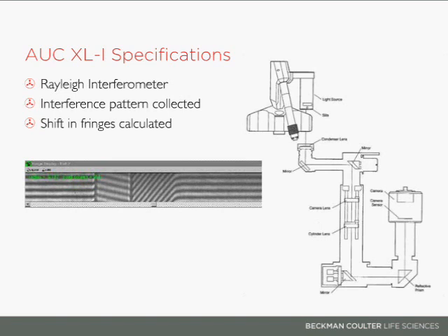This method works well for nanoparticles that don't absorb light in the visible region, some liposomes perhaps, as well as if you have your nanoparticles suspended in a detergent or surfactant solution and you want to just analyze the detergent or surfactant solution alone, without running the nanoparticles in there, to get a baseline understanding. The interference optics would be able to run that.